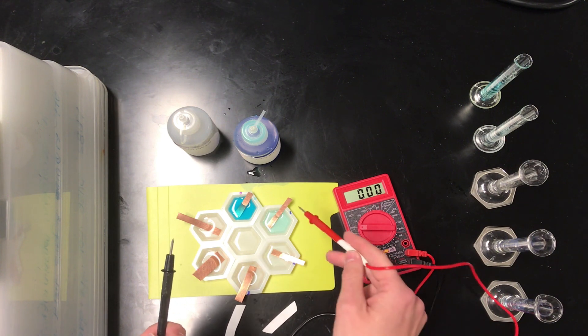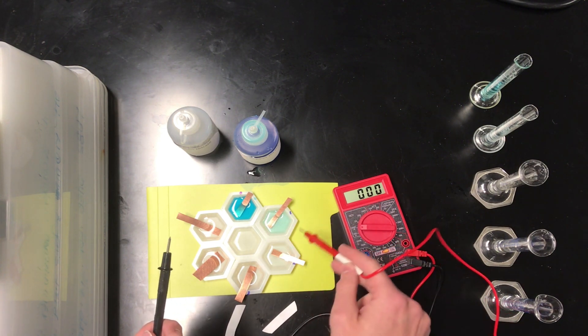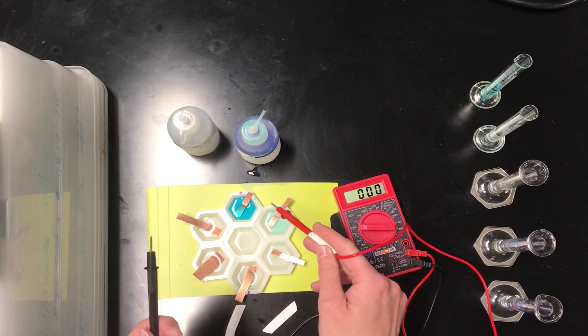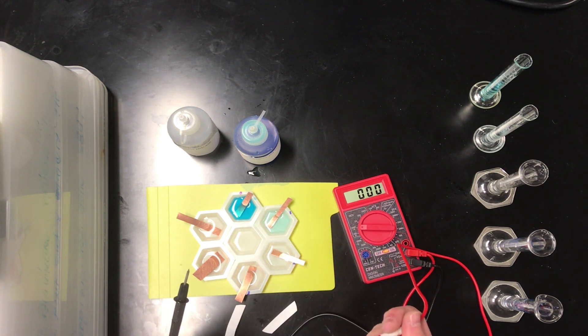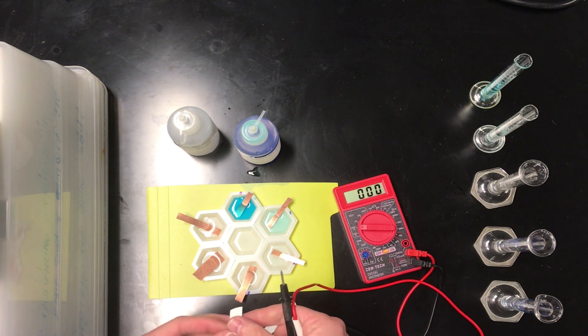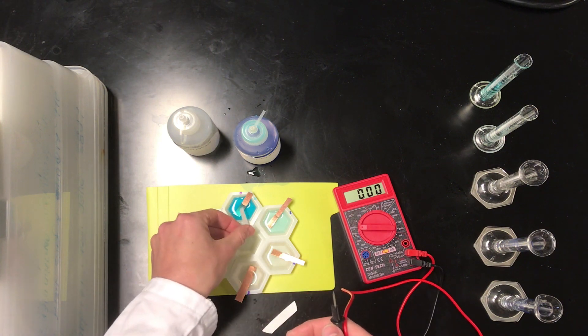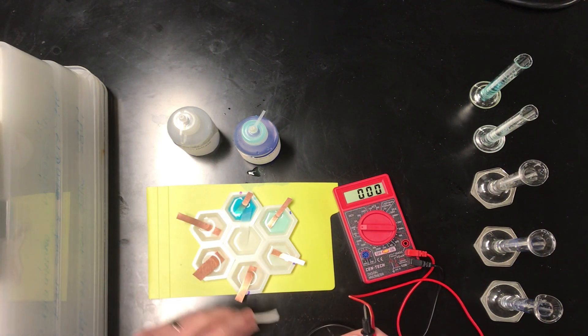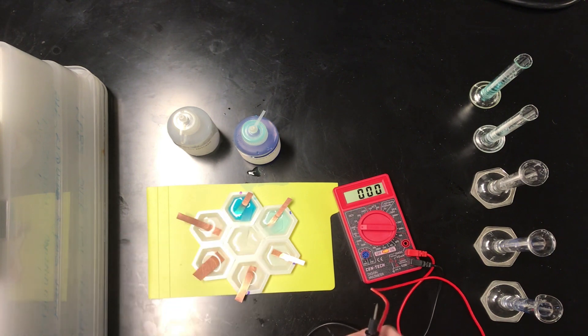Which direction do you think electrons will flow, from half cell 1 to half cell 0, or from half cell 0 to half cell 1? Okay, hopefully you've taken a moment to think about that, and I'm going to go ahead and connect the half cells via a salt bridge, and we're going to see if we can observe a voltage here.